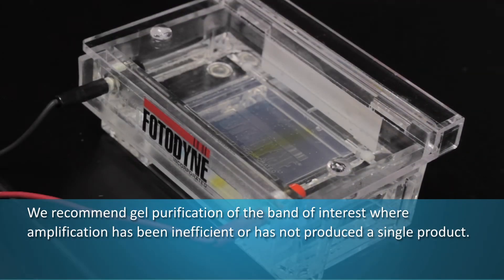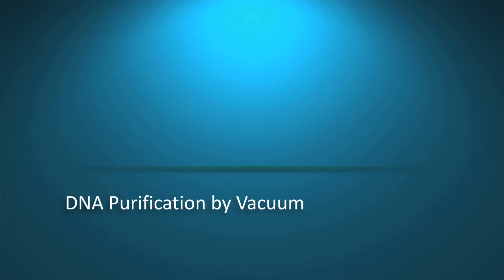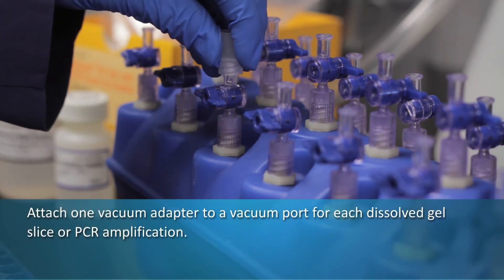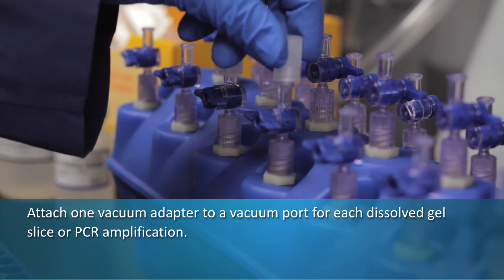Attach one vacuum adapter to a vacuum manifold port for each dissolved gel slice or PCR amplification.